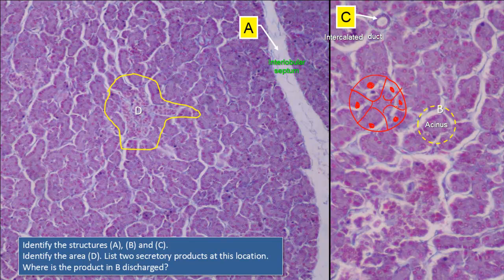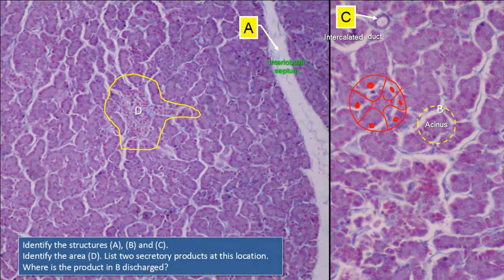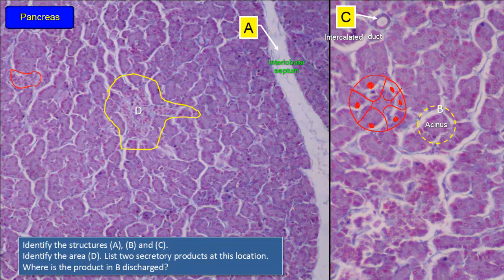The ducts present between the acini are the smaller intercalated ducts, lined by simple low cuboidal epithelium. Larger ducts may be lined with taller cuboidal or sometimes stratified cuboidal epithelium and are generally located in connective tissue septa between lobes. Apart from the exocrine glandular tissue, there is a lighter-stained area indicated in D — lighter compared to the acini. These lighter-stained areas, scattered between the acini, reflect the endocrine component of this organ.